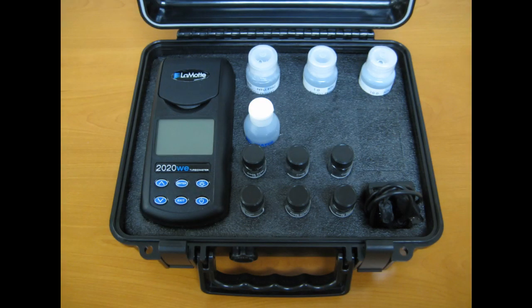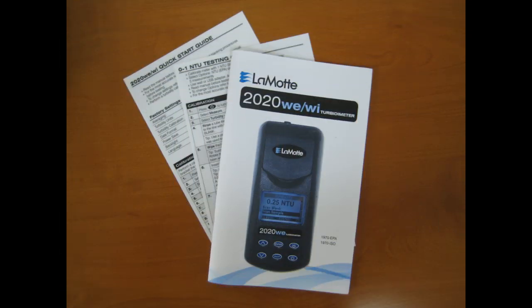This kit comes complete with a carrying case, 2020 WE or WI meter, six sample tubes, three AMCO calibration standards 0, 1, and 10 NTU or FNU, one water sample bottle, a USB cable and wall plug adapter, room for optional items such as the car charger, and a detailed easy-to-read instruction manual and quick guides.